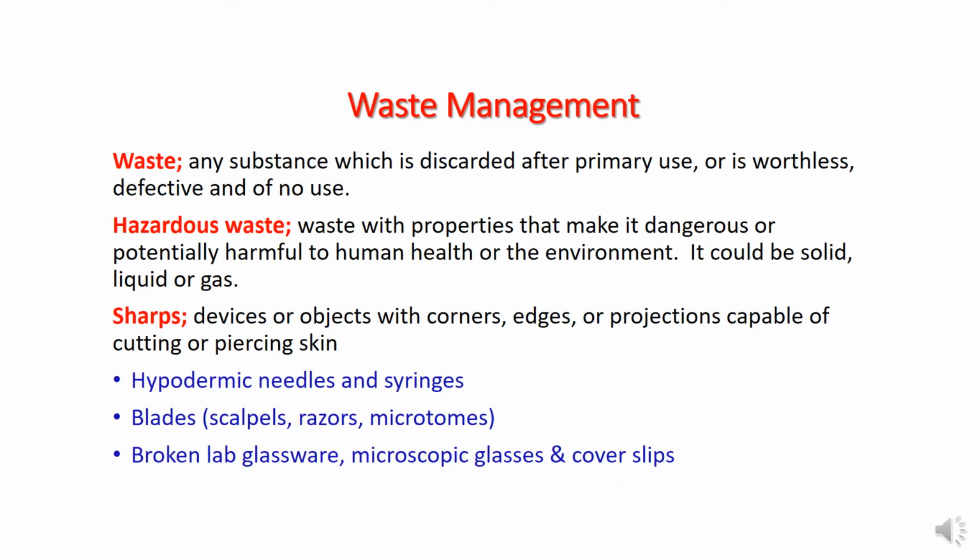Let's move on to waste management. So what is actually waste? Waste is any substance which is discarded after primary use. In the lab, while you are working with certain chemicals, liquids, dry chemicals, etc., even after use it sometimes looks like the original form. Even then you cannot consider it original. This is a waste.